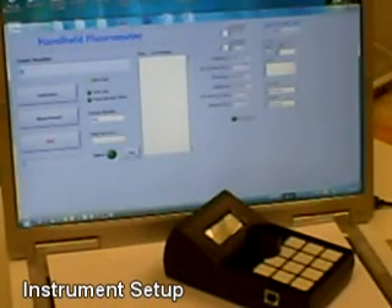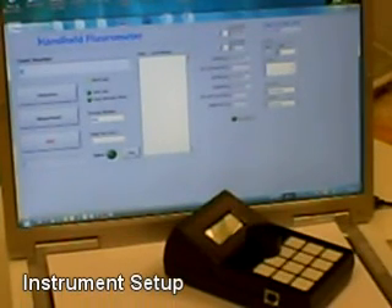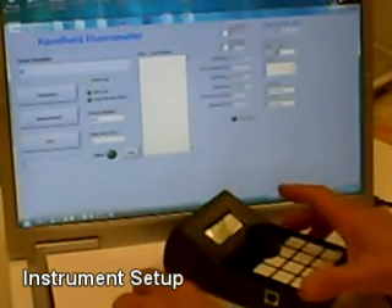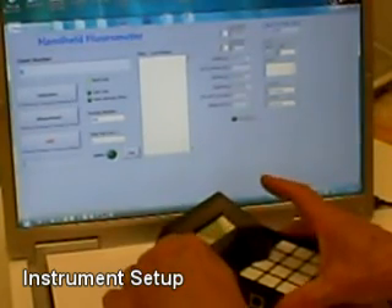Here are the procedures for performing the Flora Quick Enzymatic Water Assay System for microorganisms. First, you'll connect to your power source. Second, connect to the USB port on the computer.